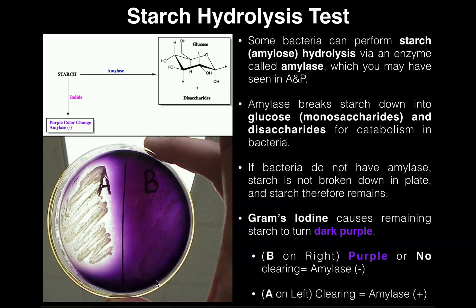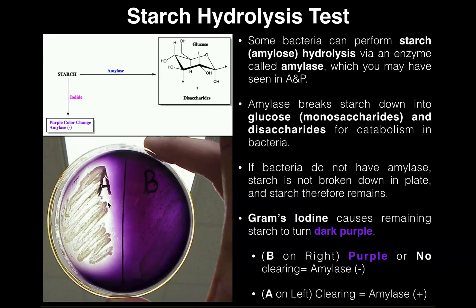We can see on the right side, pretty much all of it is purple for this species. But over on the left side for A, there are areas — particularly around the smear — where there's no purple. In fact, you can see directly through the plate.